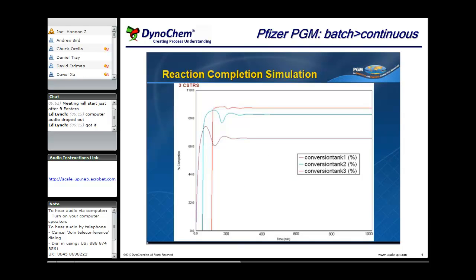And then he presented some example results, actually from a 3CSTR model, looking at conversion for a particular reaction. Conversion after tank one is the mauve curve, and then conversion after tank two is the greenish one, and conversion after tank three is the red one. So you can see progressively smaller increases in conversion, but ultimately increased conversion as you progress through the cascade of stirred tanks.